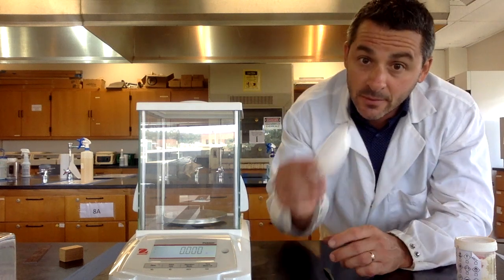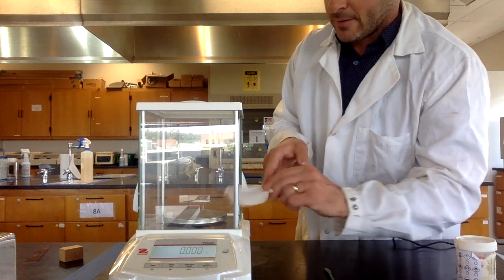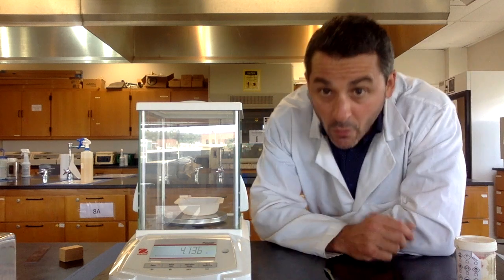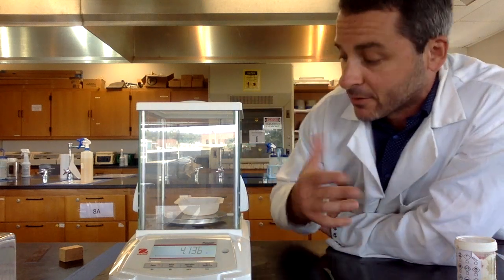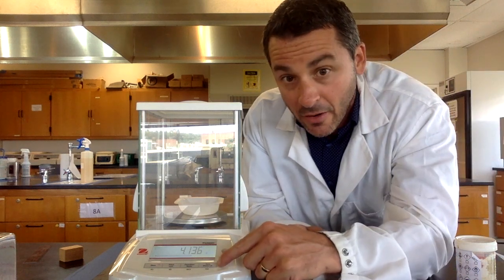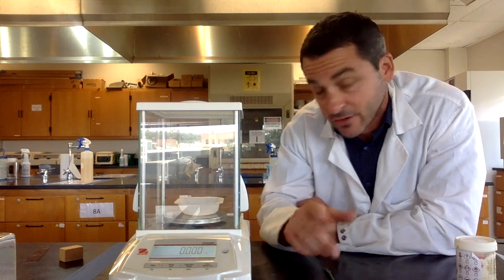So what you do is you take a weigh boat and you put that on the balance there. Now that obviously has mass and we don't want that mass. We don't care what the weigh boat weighs. So what you do is you hit the tare button, T-A-R-E. That will set the balance to zero with your weigh boat on there.